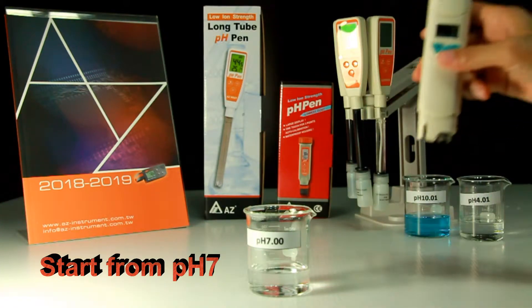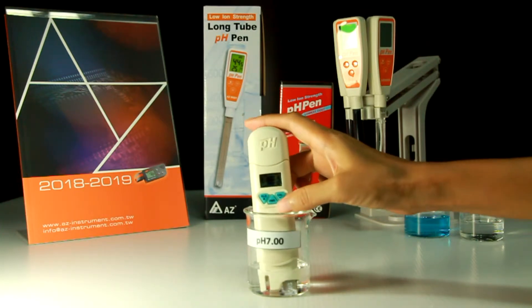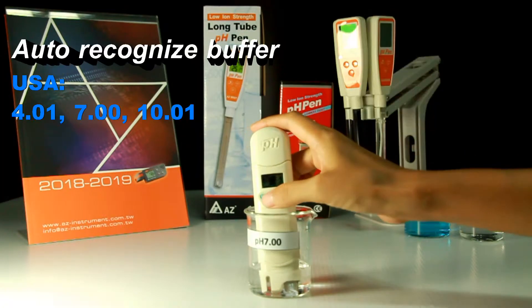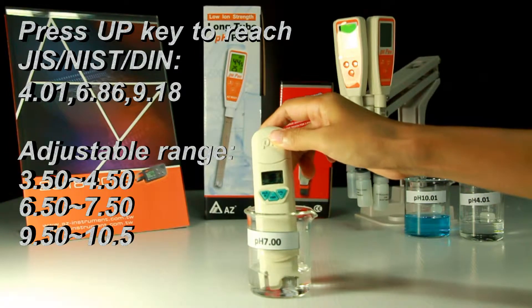Rinse the electrode with distilled water and blot it before immersing into calibration buffer. When the reading is stable, press the calibration key to enter calibration function — you will see 'CAL' flashing on the display. The PH Pen will auto-recognize the buffer. If the recognized value is different from what you are using, press the up key to adjust until the reading matches your buffer.